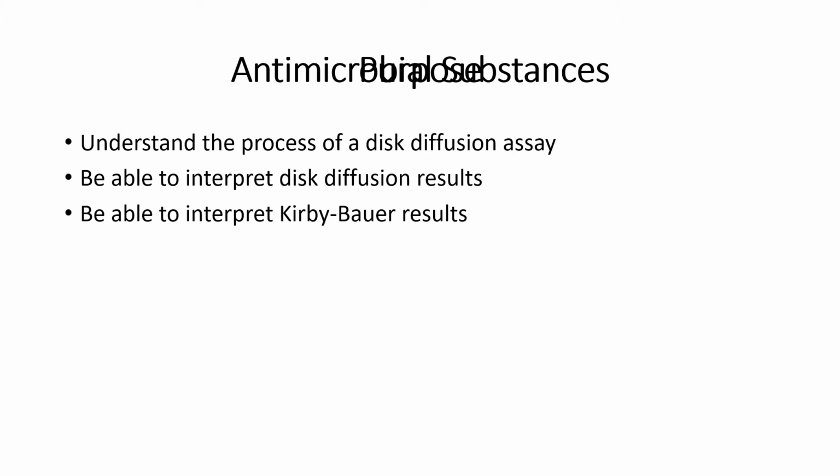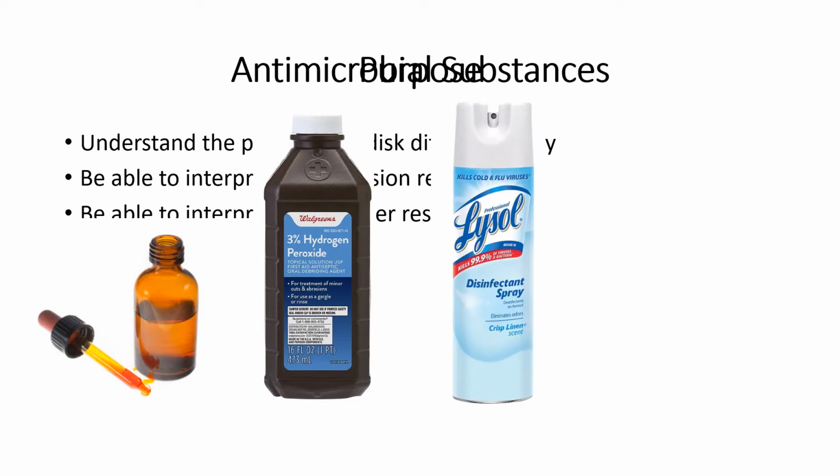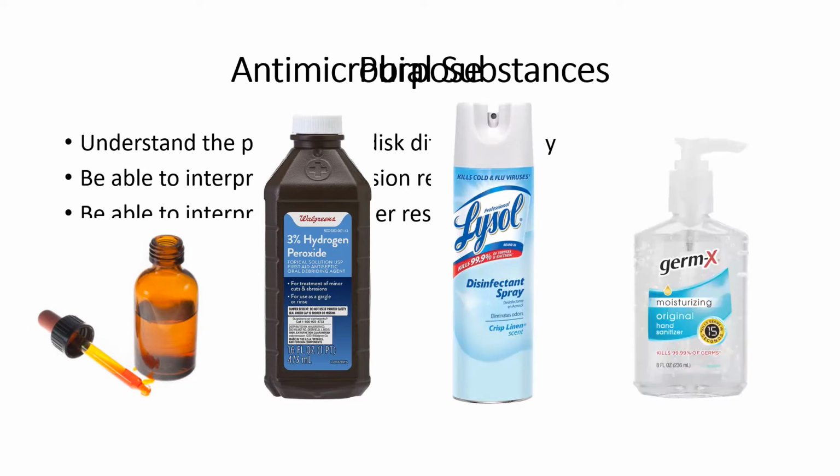There are many different types of antimicrobial substances, and some examples are iodine, hydrogen peroxide, phenols, like you find in Lysol, and hand sanitizer.